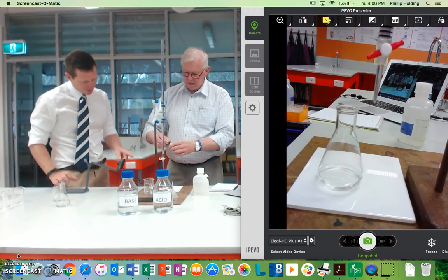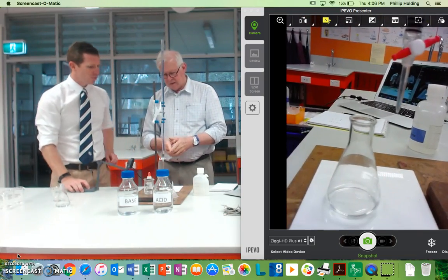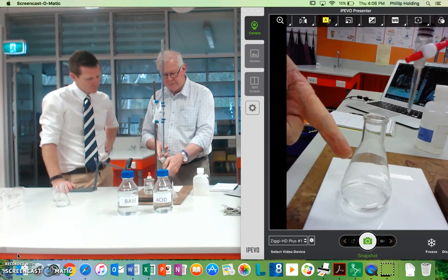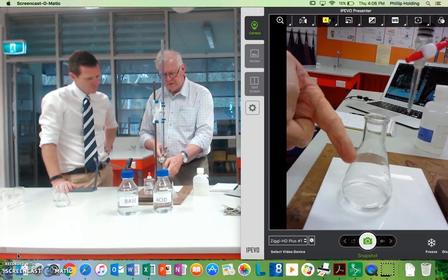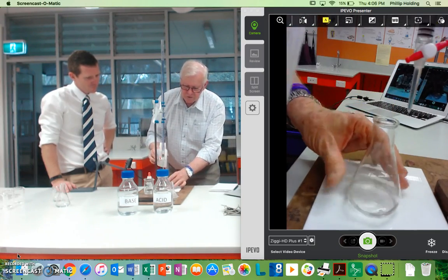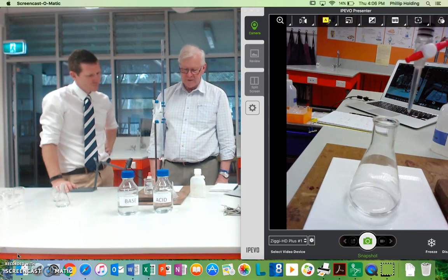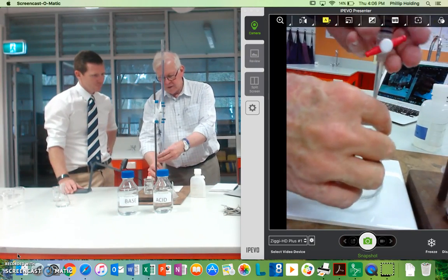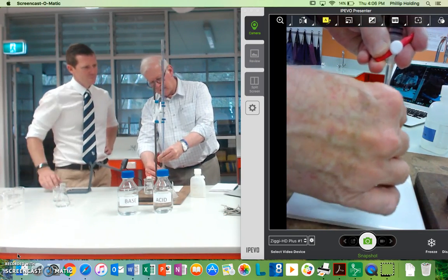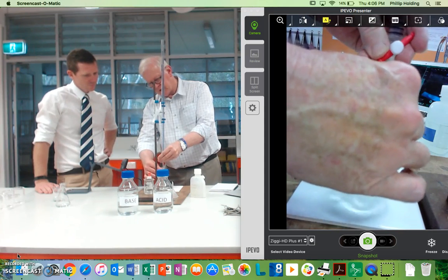So that's clear, but I can see there — I don't know if we can see — but I can actually see there's some pink residue on the side. Because a little bit of that has run down the side of the beaker and been affected by the indicator, so we get a pink color. Now if that's a problem, you can, with a little bit of water, wash the material down, because we don't want material left on the edges of the glass on the inside. So I take a while to get a feel for the tap.